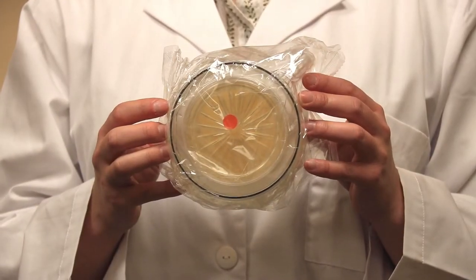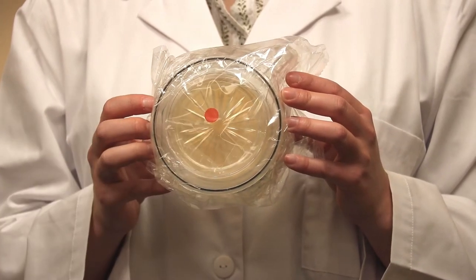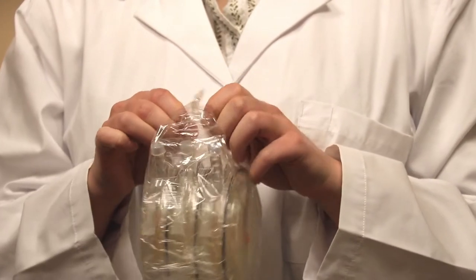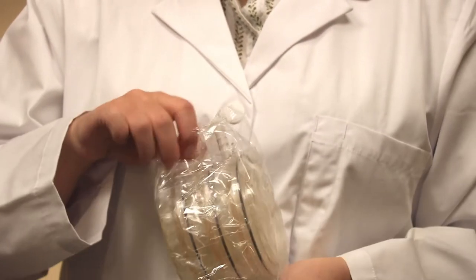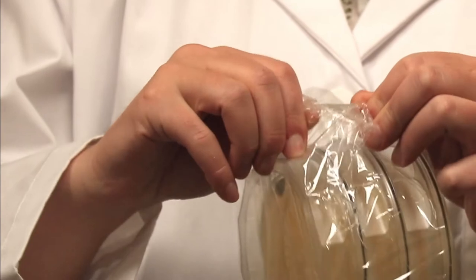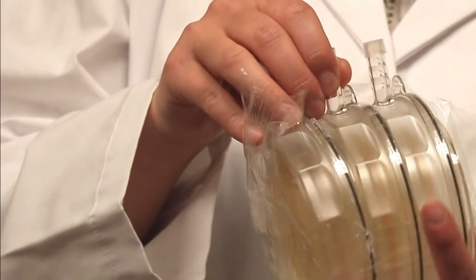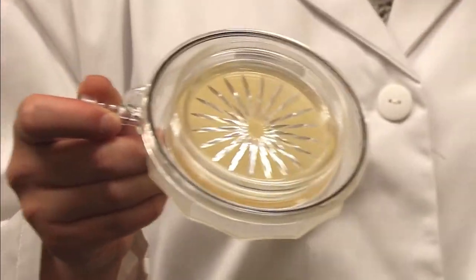Lexi is going to open this pack of our typical 25 to 50 liter per minute BioCap Single Use. As you can see, they are gamma irradiated and that red dot will show up on all of your packages. You'll notice they're double wrapped — Lexi is opening that very first package — and they're still wrapped in triplicate. There's another packaging around all of them. And there you have the 25/50 liter per minute.